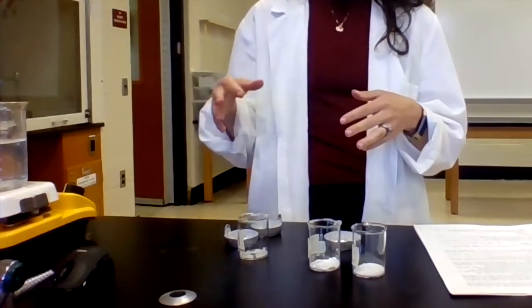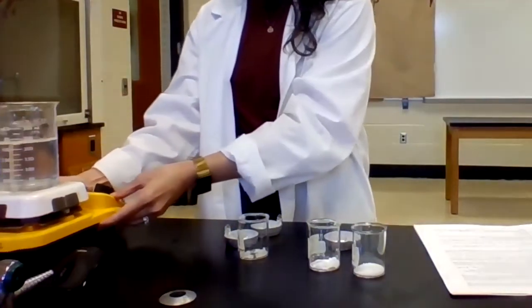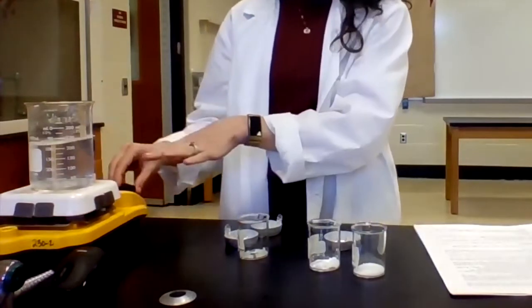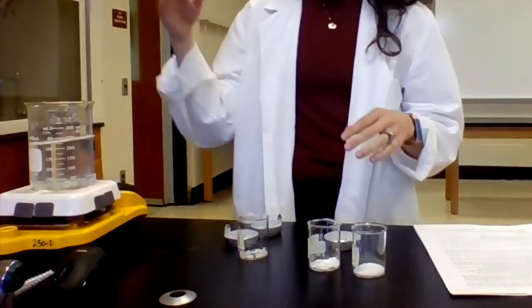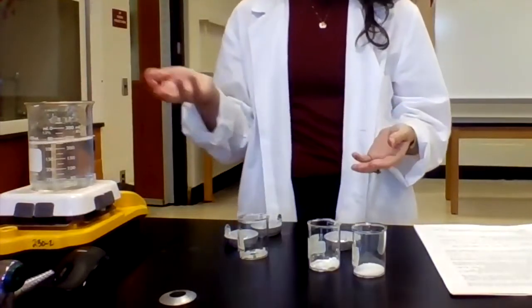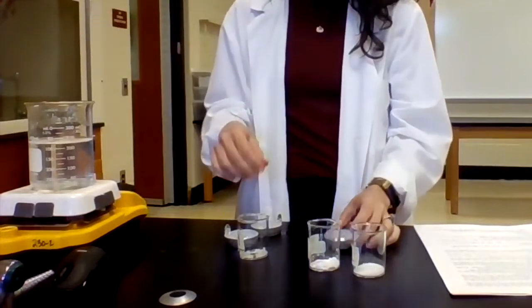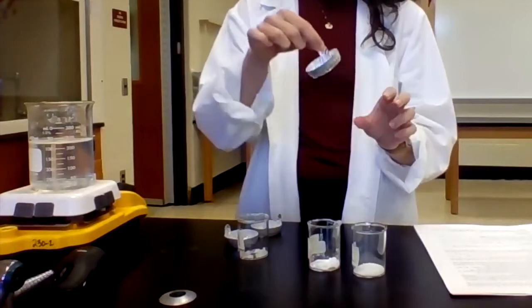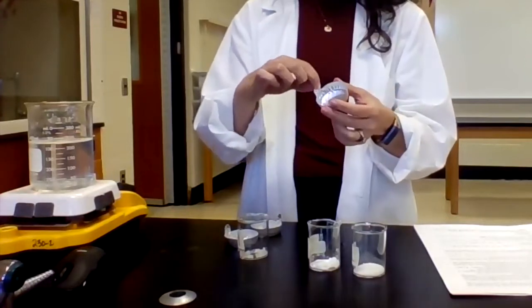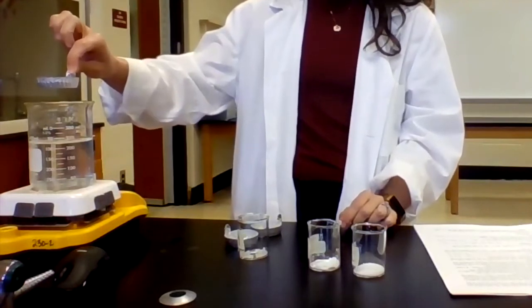The way I'm going to see if it has a low melting point is by using a hot water bath. So I have some boiling water here, and then there's steam up above. Since I know that water boils at 100 degrees Celsius, I know that's the temperature of the steam. So I can put a little bit of the solid into this aluminum evaporating dish and simply hold it over the hot water bath.